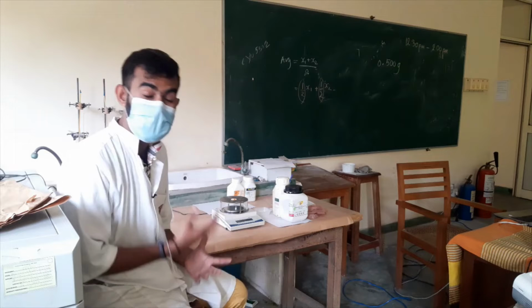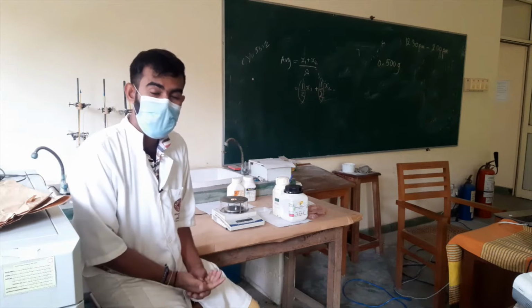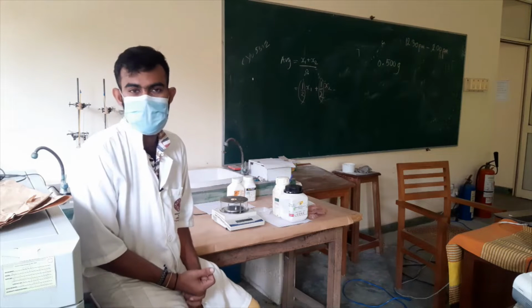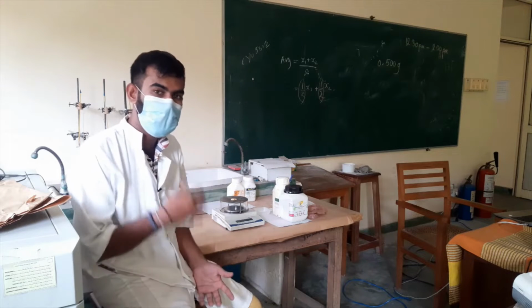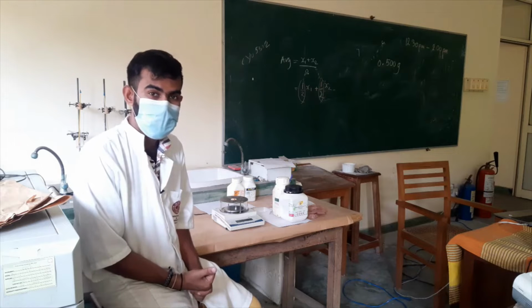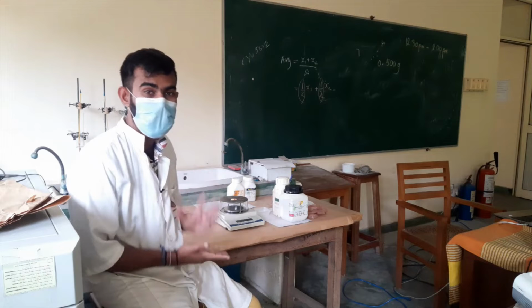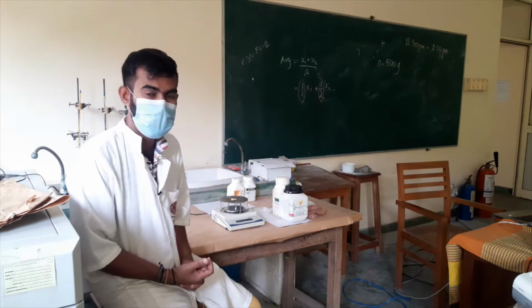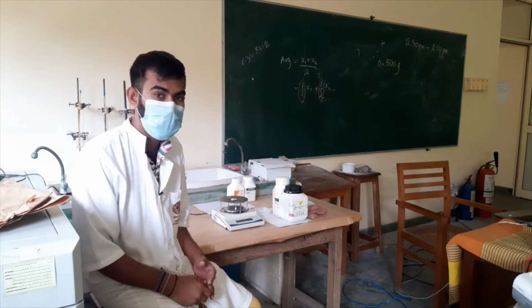Today I'm going to guide you how to prepare a TLC plate by using silica gel. First of all, we are using this TLC plate for chromatography, actually thin layer chromatography. Here we are using silica as our stationary phase and the relevant solvent, as you desire, as the mobile phase.